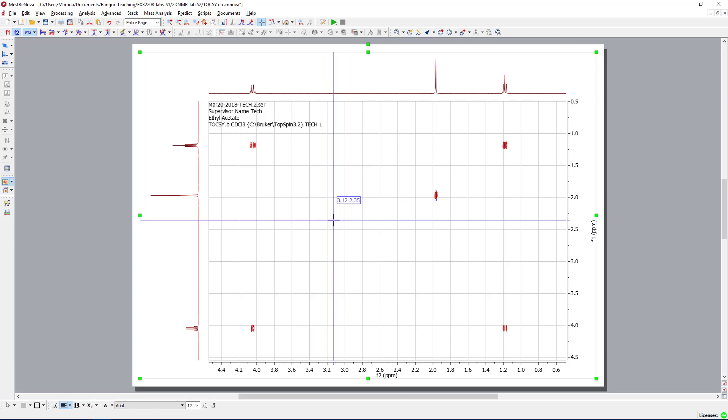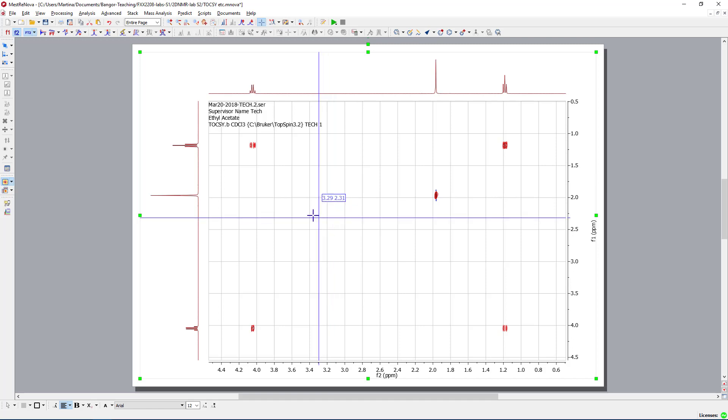Why is this? The TOCSY allows us to see the total correlation, so every single proton that is coupling with a proton will be visible. However, if you break the chain, you won't see a correlation anymore.